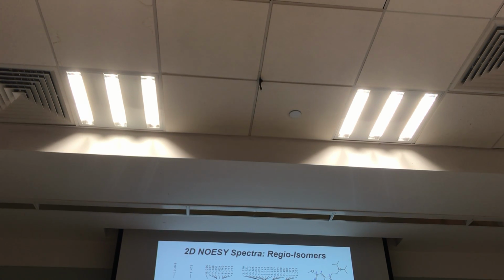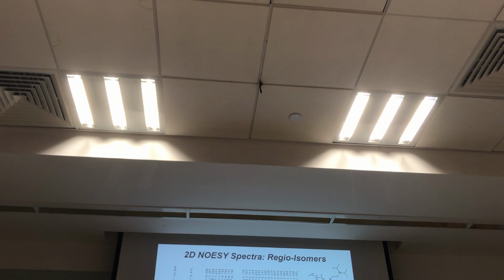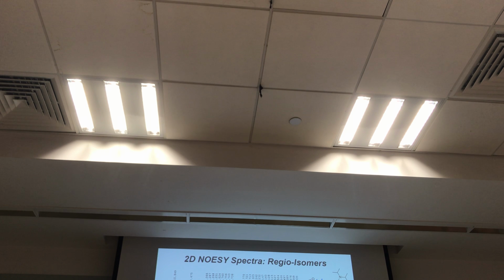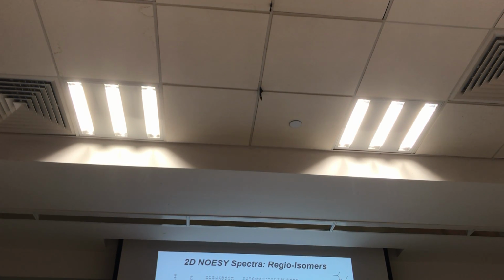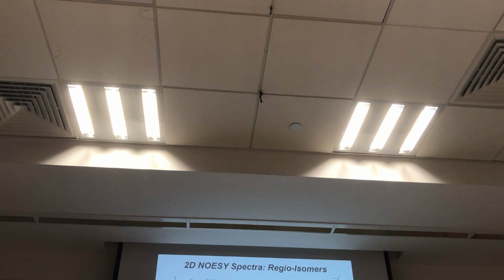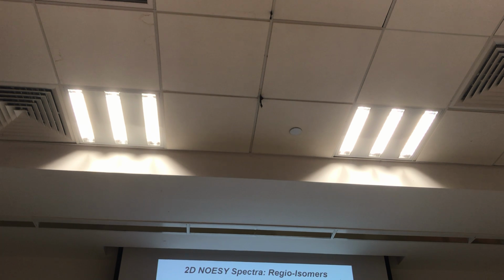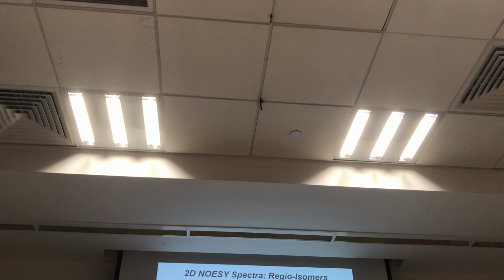Right? Now you will see these 3 protons, 3 types of this, 2 proton, 2 proton, 2 proton. You will see which one is that methylene group. Normally we expect lower chemical shift for benzylic than the CH2 next to nitrogen, right? That means one of these two will be this kind of benzylic CH2. That's this, one of this little one.